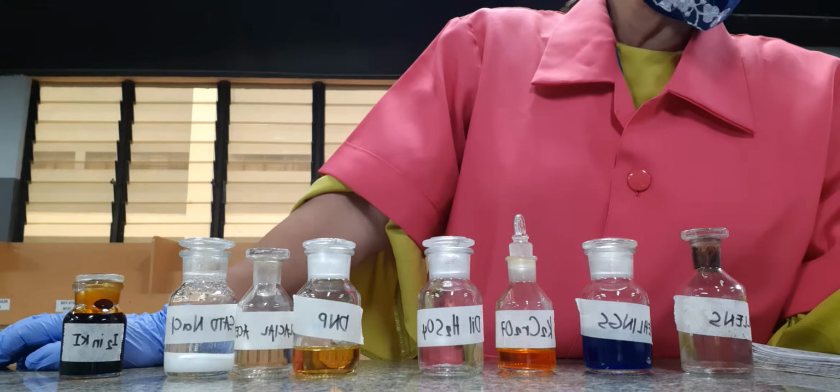So we will be conducting our first experiment using these different aldehydes and ketones.